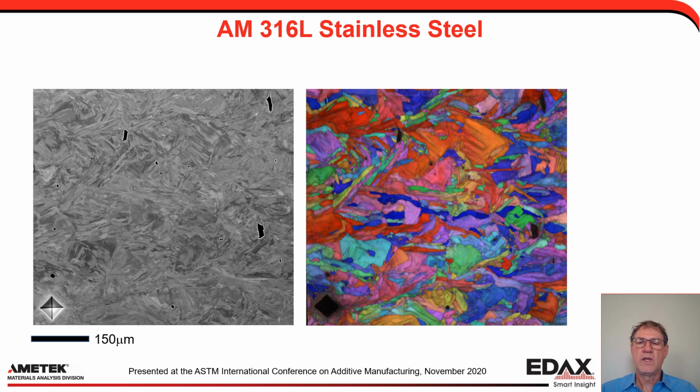The point being that we can reconstruct the grains from the orientation measurements, as you can see in this image here. The image at left is what we call an image quality or pattern quality map. So a light point or high intensity point in this image has a high quality pattern that it's produced, whereas the dark ones are low quality patterns or even no pattern at all in some voids. And then we know the orientation.